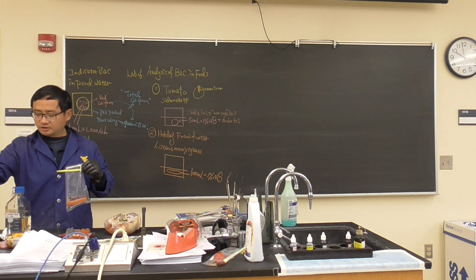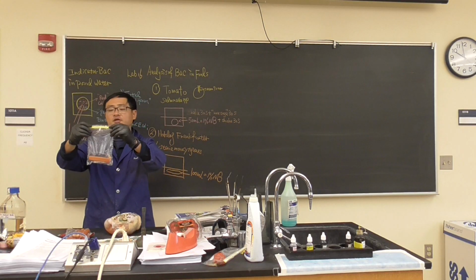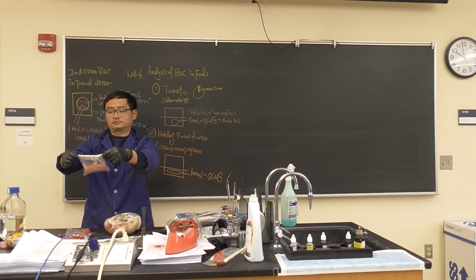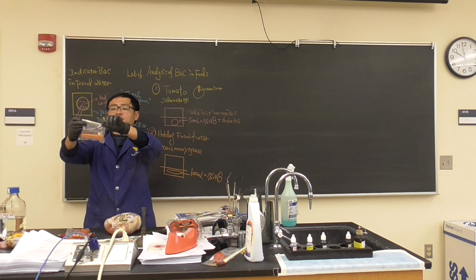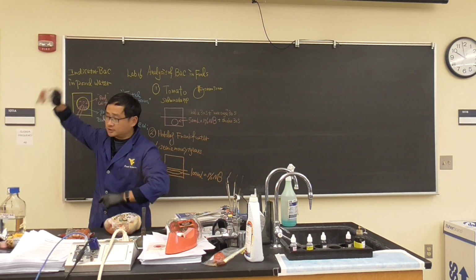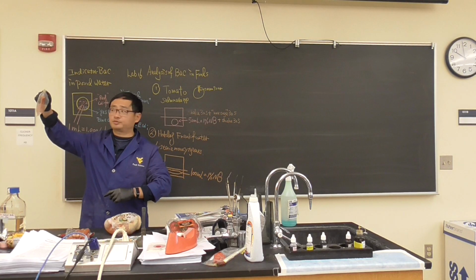The process needs to follow the USDA FSIS regulation. How do we do it? Hold on here, roll a couple of rows. Then you have an air gap in there. You vigorously shake 30 seconds. That's the standard procedure.